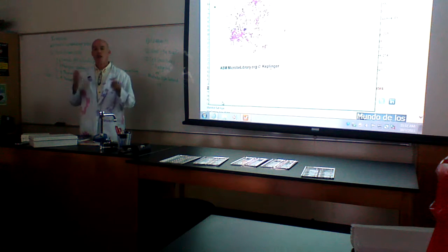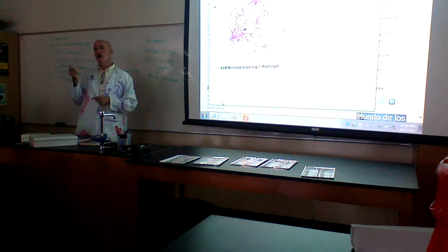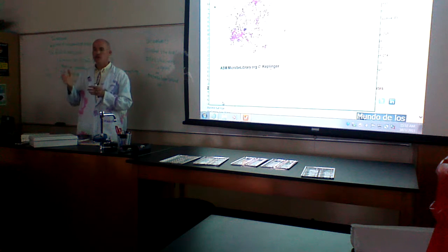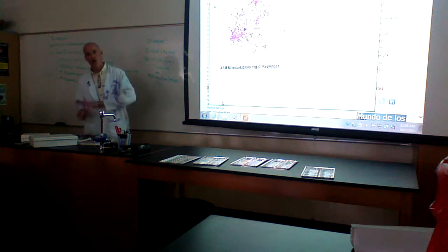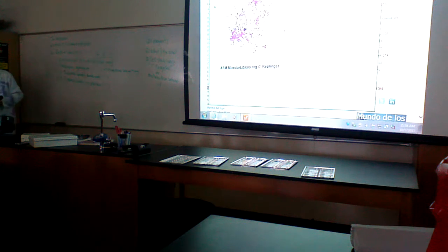We have a lot of situations where you're able to rule out a lot of bacteria. Like let's say it grows on an EMB plate and it turns it a color, but it doesn't turn it green. Okay, well, you can tell me a lot of things, but you cannot definitively identify it from what I've told you. That's fine. The ability to rule out all gram positives or all gram negatives, or in this case, all non-acid fast bacteria, is really helpful. That's a good question.